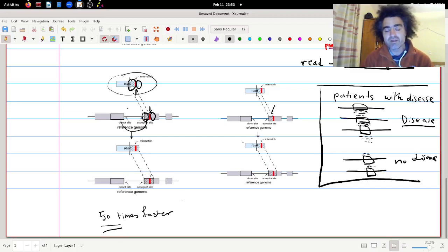Okay, maybe nowadays there are also some other very fast tools, so I don't really claim that it's 50 times faster, but it's a very efficient one, and even though it's not very recent, it's quite an old program, it is still considered to be the state of the art. It needs some memory, but thankfully new computers have quite a large memory, so STAR runs actually without any problem.